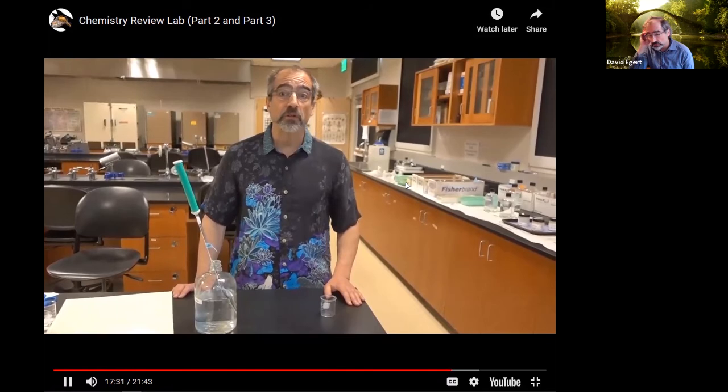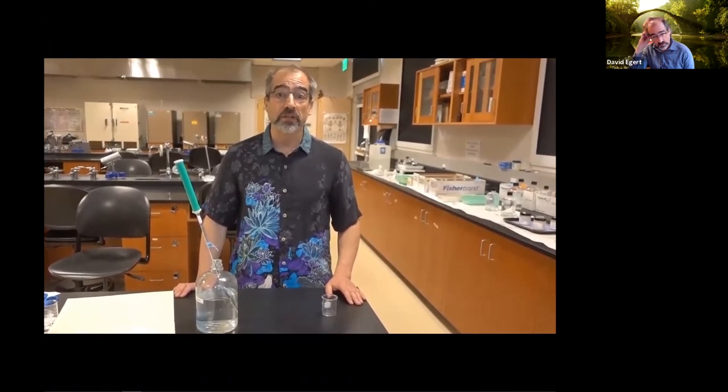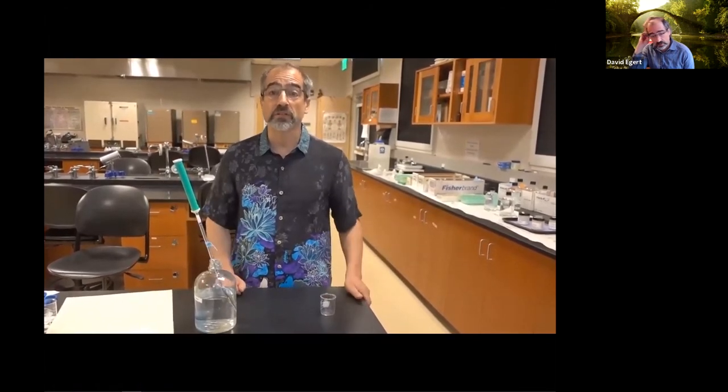All right. So we're gonna finish up here with part 3, which is just another few minutes here, because instead of 3 things, we're just looking at one thing. Part 3 of the chemistry review lab is basically the same thing as part 2, except instead of using an electrolyte, we're using a carbohydrate, in this case glucose.